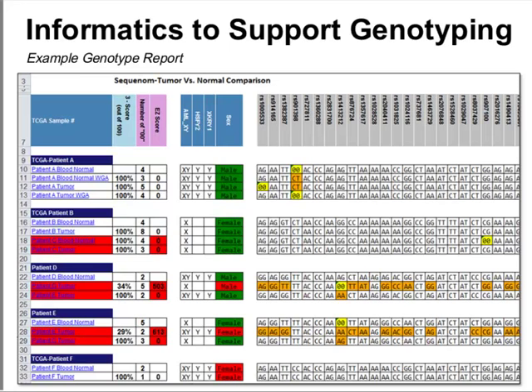If there was greater than 10, that was unusual based on historical performance, so we repeated the sample. And then we also created this easy score, which is a very lowbrow quantification of the type of mismatch. So if you have a homozygous germline SNP where you gain an allele in the tumor, that is not expected based on what we know about tumor biology. The opposite is possible, so that would be a phenotype known as loss of heterozygosity. So here you've got a heterozygous down to a homozygous. That's well-known cancer biology. This is unexpected, so we penalize that.